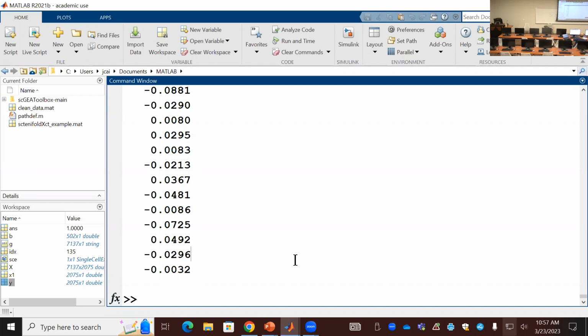All you can see is number. You put your name of gene here, whether it's a number. If it's yes, it will be one. And then you can also get the index. So there are different ways you can find the index.